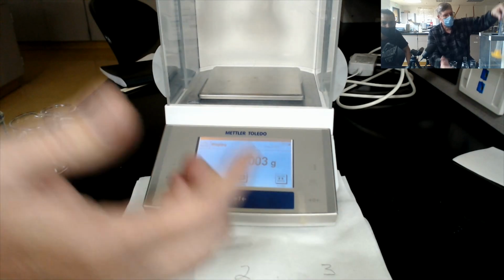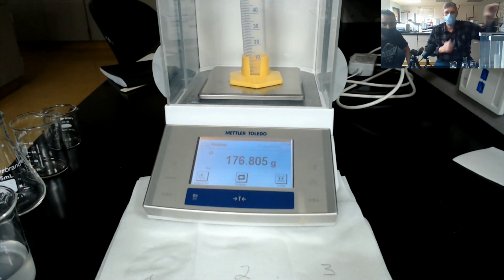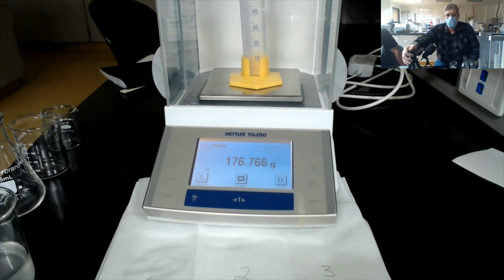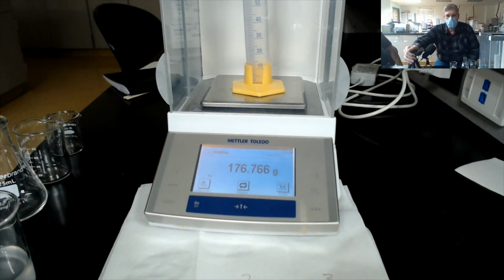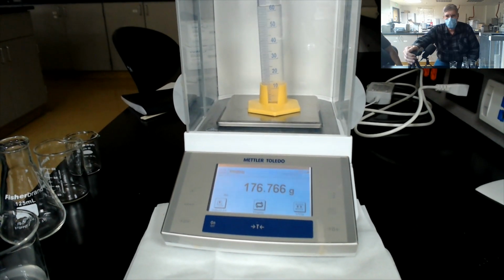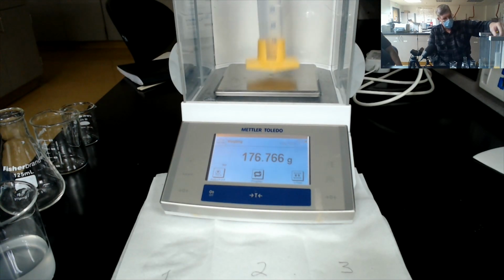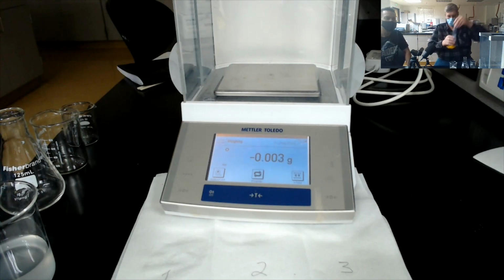Okay, record the volume. Now we will record the third mass. Now, something you should notice: we will have 3 different volumes with 3 different masses, but when you calculate the densities, they should be nearly identical. Okay, that concludes part 3 of today's experiment.